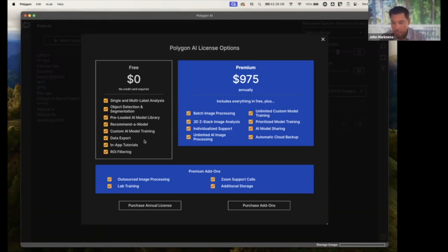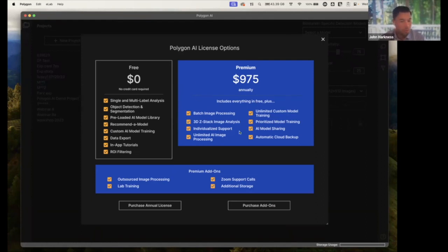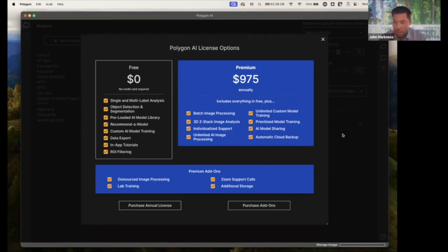So even in the free version, you can train two custom models. This is what we see being sufficient for the majority of our users. But if you're a power user and want to go beyond that, then you can add on some of these additional capabilities and really take it from there.